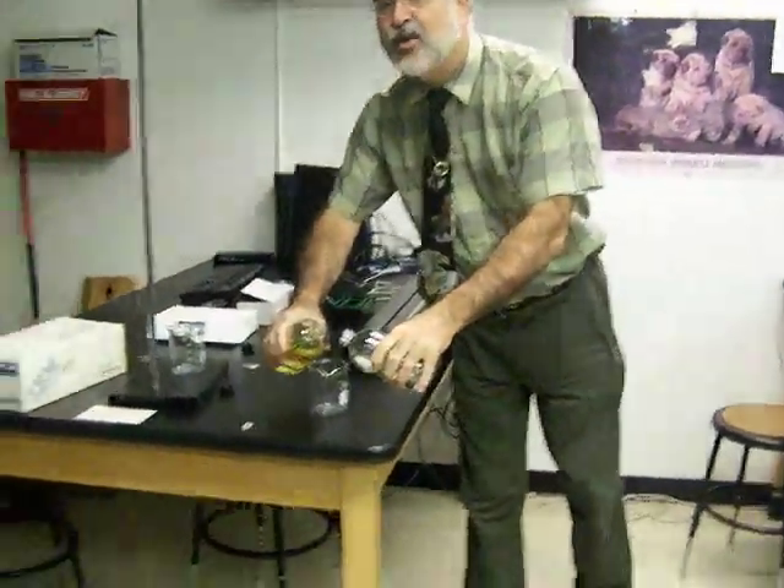And I'm literally going to pour these two in there. I'm not going to pour all of this, but about half of it. Okay, so here we go.